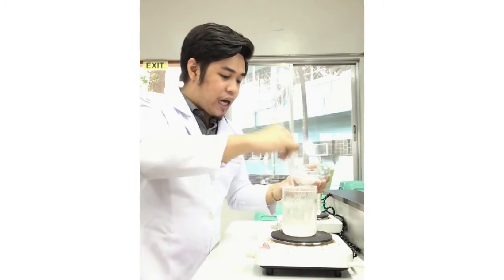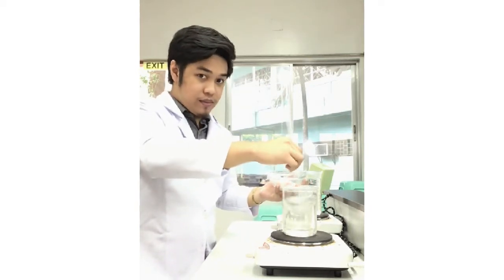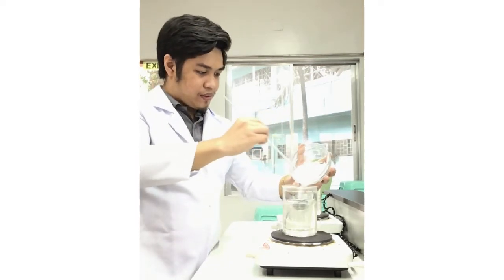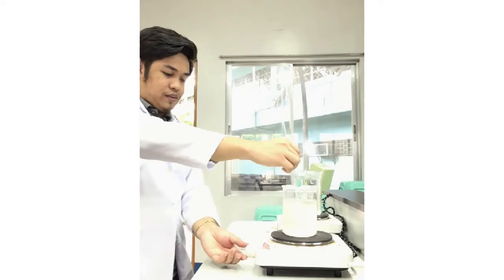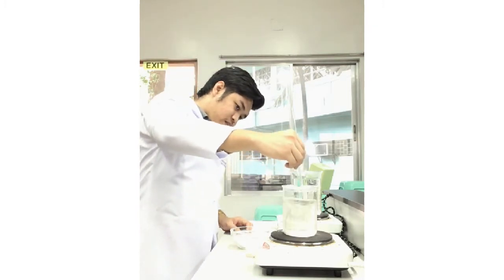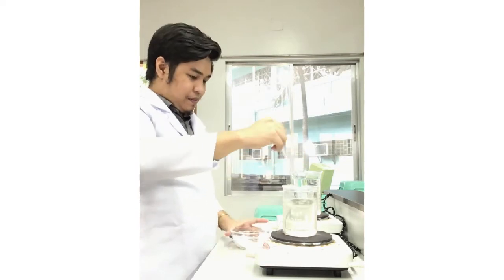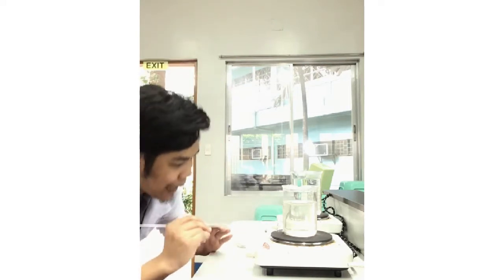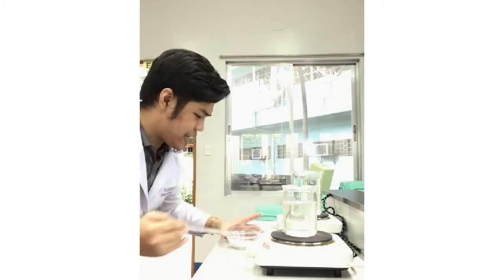We will keep on putting alum powder in this water until the water cannot hold any more alum powder. Just keep on mixing. As you can observe, I can see at the bottom that there are particles that the water cannot dissolve yet, but let us try to keep adding more.